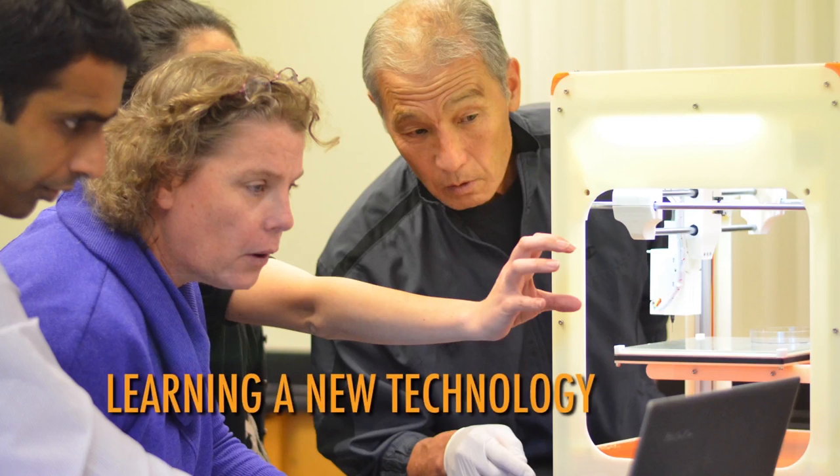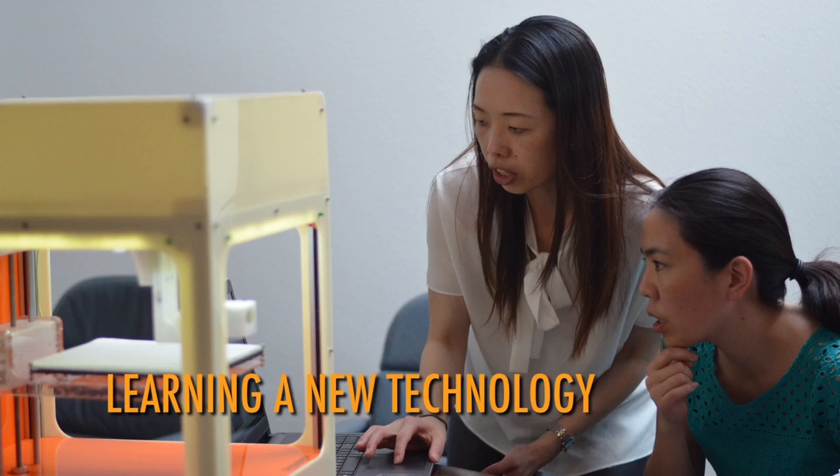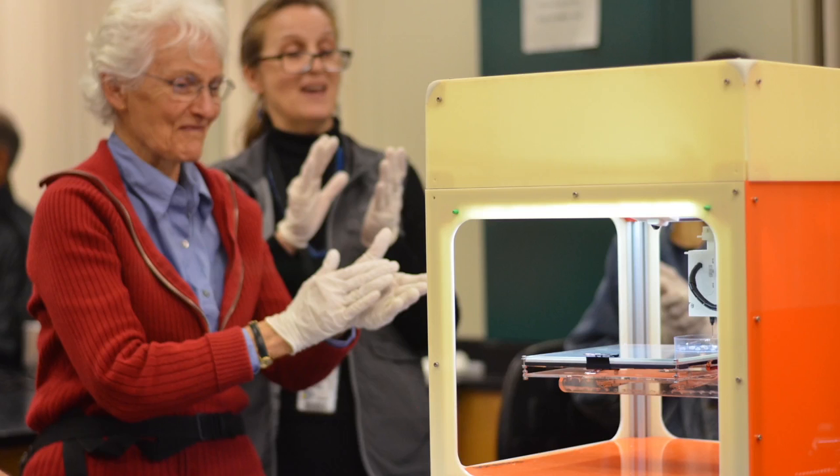The workshops that we've been doing are very, very helpful. If the idea and goal is to continue to proliferate the use and understanding of 3D bioprinting in schools, I think those workshops are going to be critical.